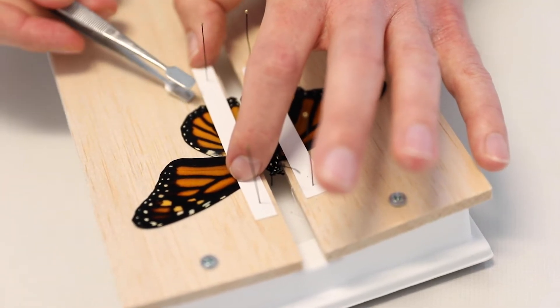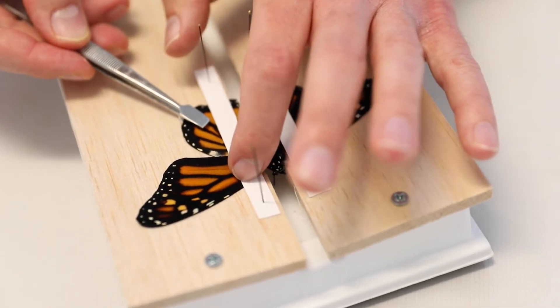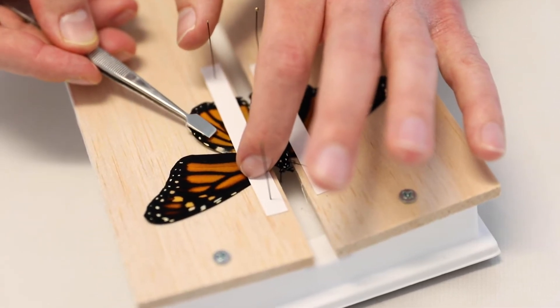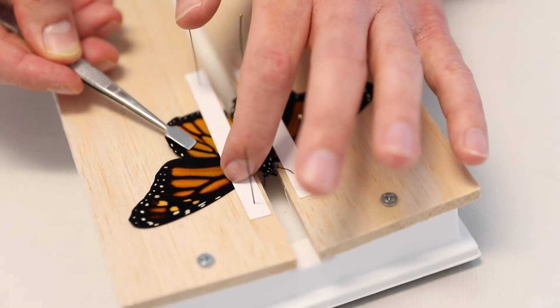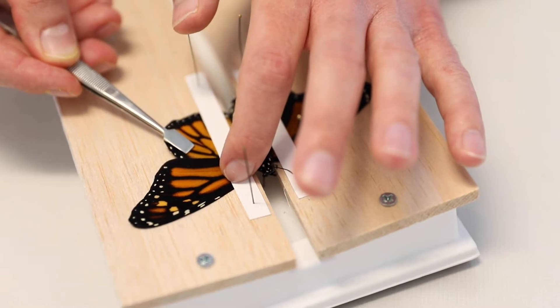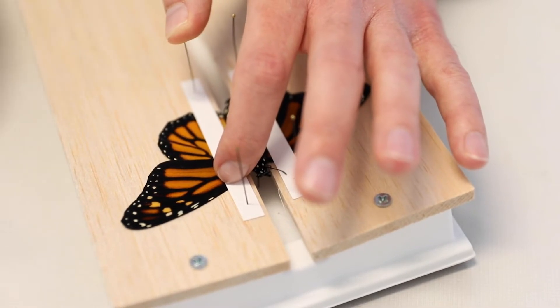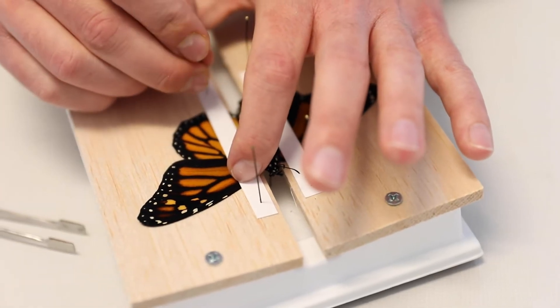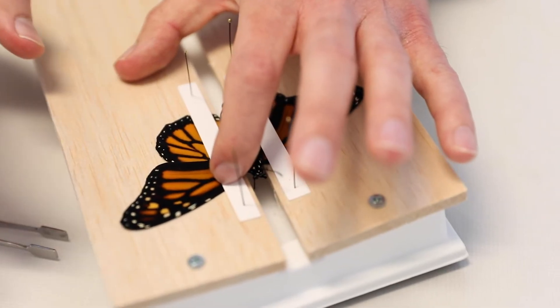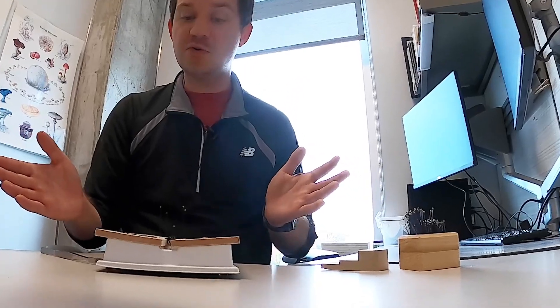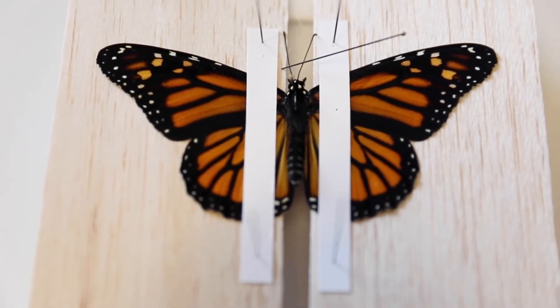I'm going to do the same thing with the bottom wing. I'm putting a little bit of pressure on the front wing here just so when I release the pressure from the back, that front wing doesn't start coming back down. I'm going to put some pressure on that forewing, release the pressure on the back wing, gently get my forceps underneath that bottom wing, grab it by the thickest veins which are usually up front, and just move this into a good position.